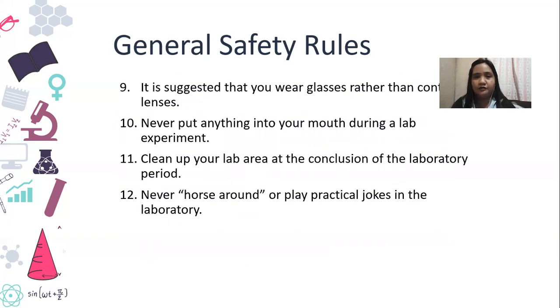And also, it is suggested that you wear glasses rather than contact lenses. Well, this is so because if we have a heating experiment, the fumes might be trapped on your contact lenses. So if you can wear glasses instead of your contacts, that will be better.